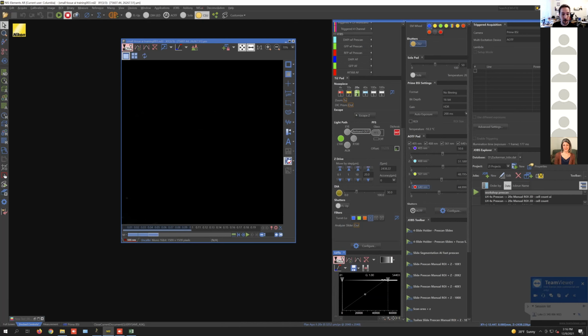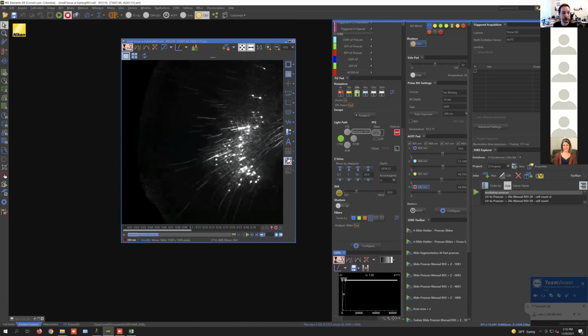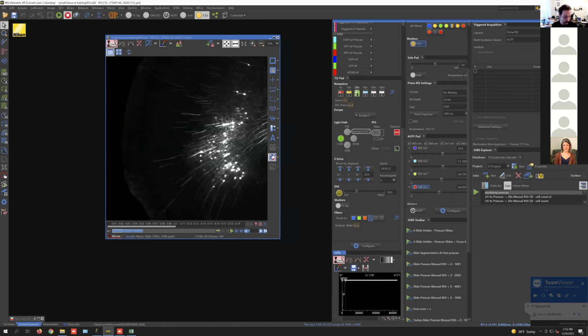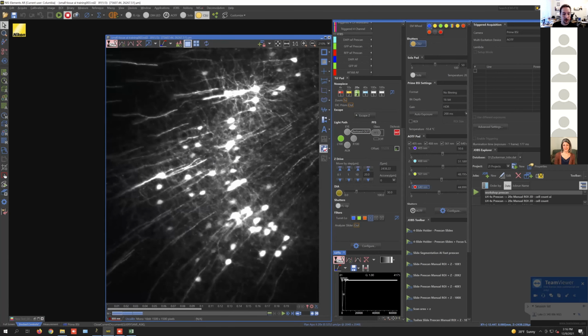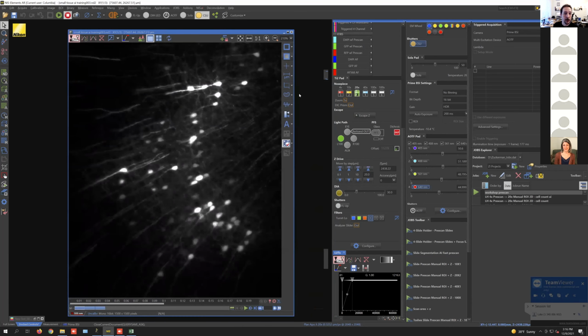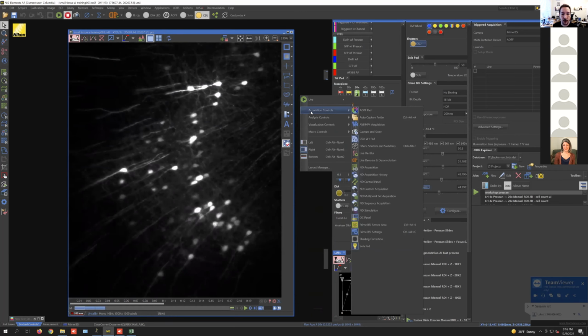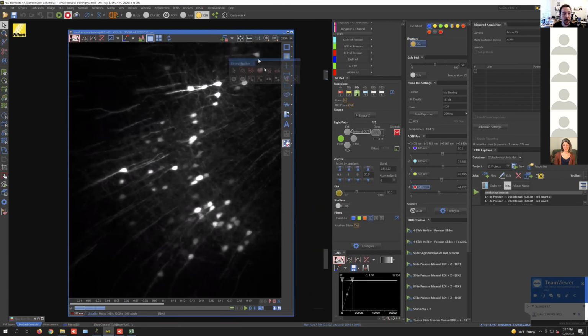And then to start to create the masks for training, let me just zoom in so you can see clearly. Just adjusting this so I can see a little bit better. With Elements, if you right click on the background, there's some analysis controls here. And the one that we're looking for is this binary toolbar. And this is a really useful tool. You can try and detect all the cells at once if you've got a pretty easy job. Probably you won't be able to, otherwise you wouldn't be using the Segment AI.